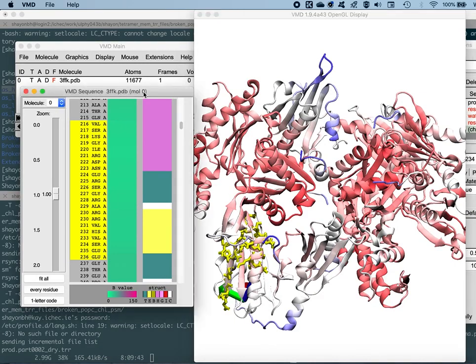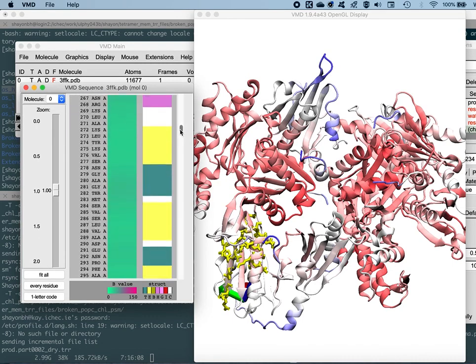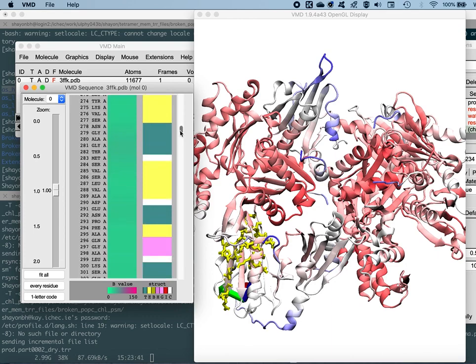Okay. So you can correlate and make an assessment of the different regions that might be involved in binding as well. So the more fluctuating the region, the more prone they are to bind to a particular ligand or any small molecule that might come in its vicinity. And this is also a check before running your molecular dynamics simulations, just to see how strong a hold of a structure your protein is, so that once you run the simulation, you can have the atomic fluctuations and compare them with the temperature factors in order to reach a strong inference or conclusion.